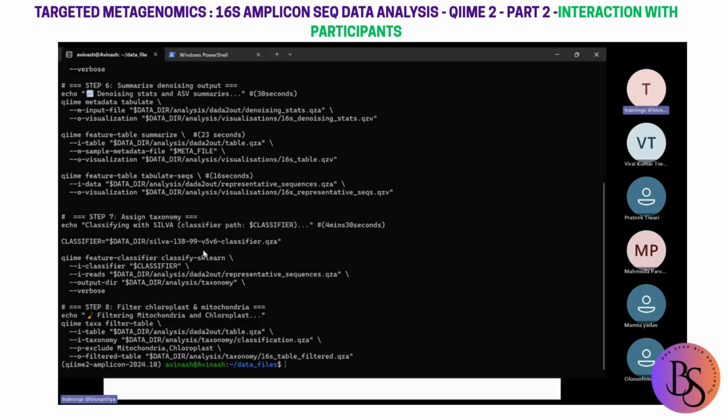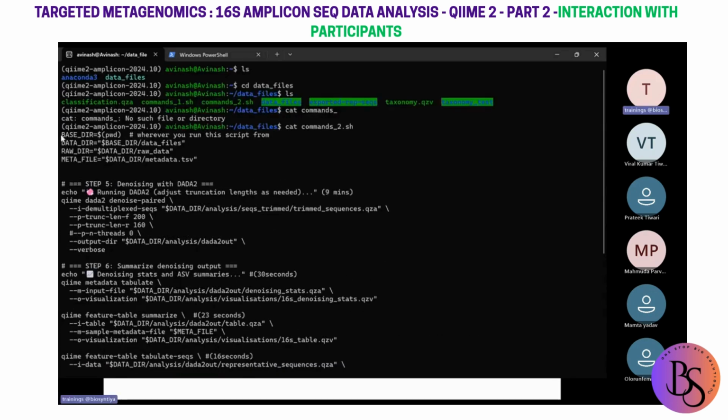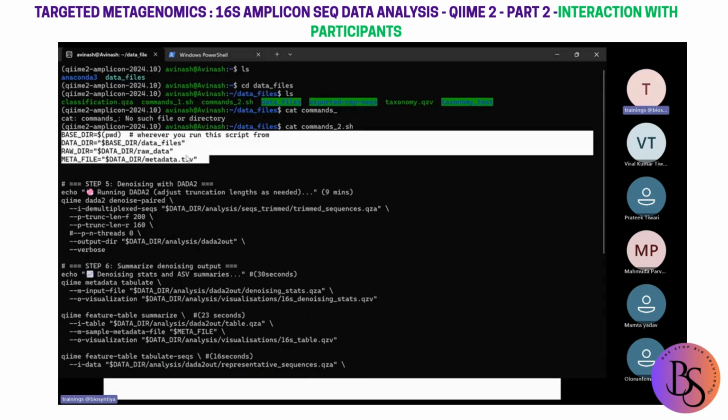Okay. So select this line first, copy it and paste it on your terminal. Okay. Press enter. Okay. So as you can see, the next step that we have to do is, okay, by the way, you have to repeat all these 4 steps again right now.